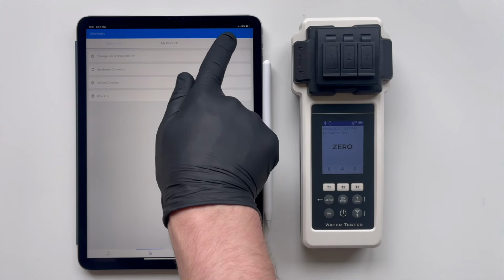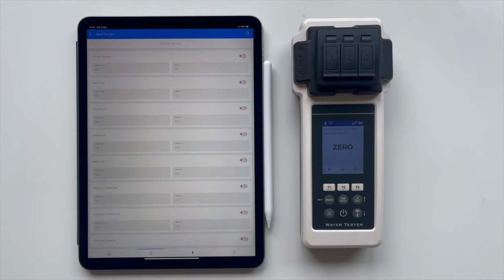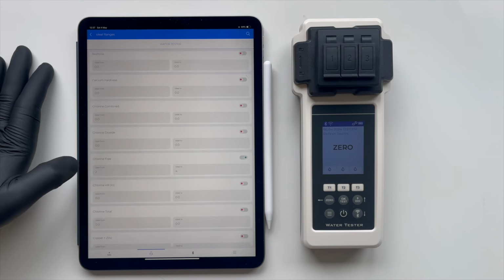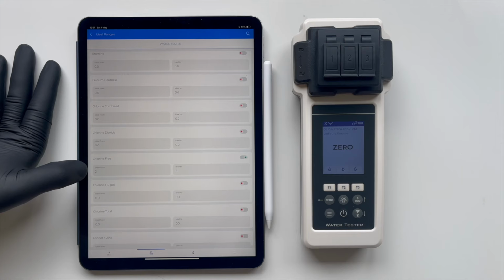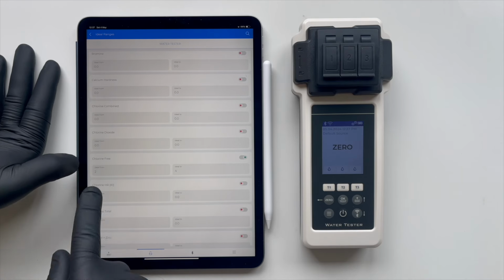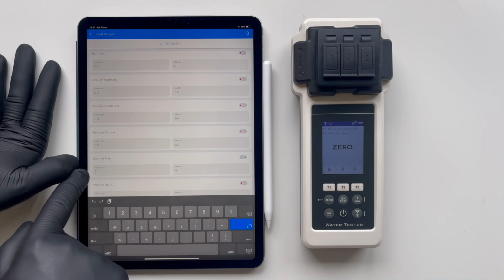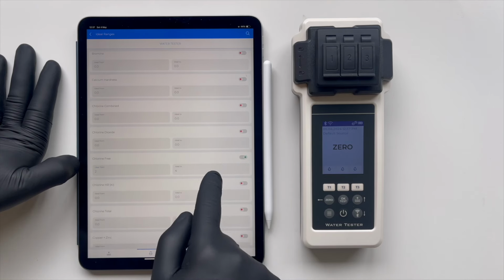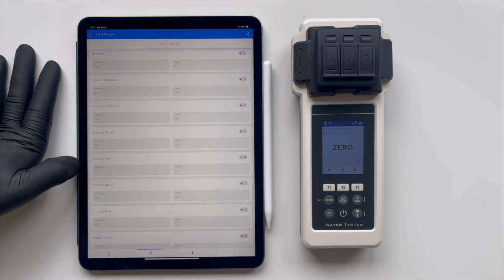We'll show you with one parameter. For instance, let's take chlorine-free. We set it to a minimum of 2 ppm and a maximum of 4 ppm. Toggle the switch to the active state and return to the previous screen.